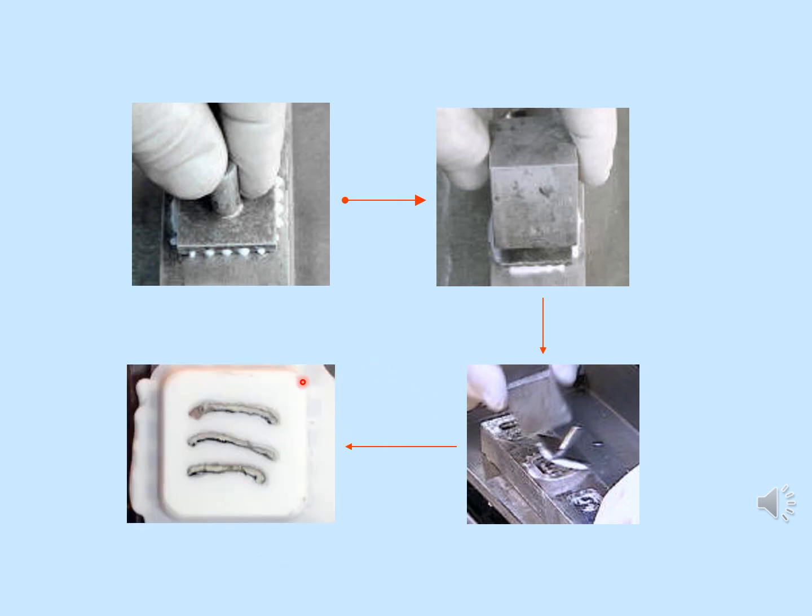Now, since you have already learned about tissue processing, you will know that during regular tissue processing, once the biopsy is done, the piece of tissue goes into formalin, and then the tissue gets fixed. Then there's a whole processing wherein the water inside the tissues is replaced by xylene, and then replaced by wax, and then we create a wax block which we use to actually section tissues. That's currently the processing for biopsy that is done.